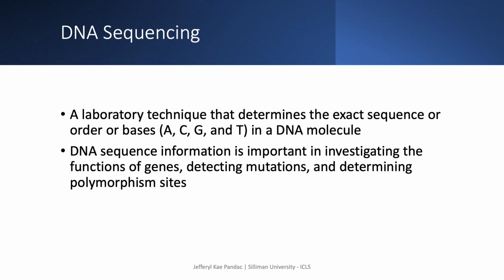With this, DNA sequence information is used in the medical laboratory for a variety of purposes, including detecting mutations, typing microorganisms, identifying human haplotypes, and designating polymorphisms. Treatment strategies, including targeted therapies, are now selected based on the results of DNA sequencing techniques.